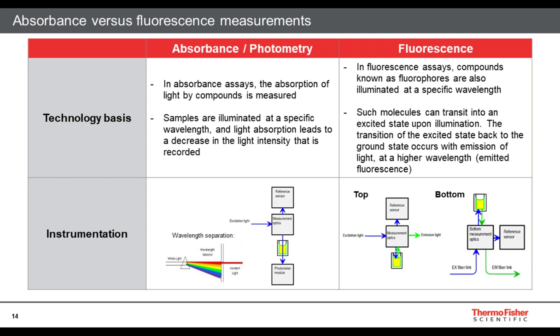I'll start with a very simple comparison between absorbance, also called photometry, and fluorescence measurements. Bear with me, I know that many of you are familiar with these technologies. I just want to give you a very brief overview so that you can understand why the way the technology works really influences the way our instruments are designed, and in general, how most microplate readers are designed.